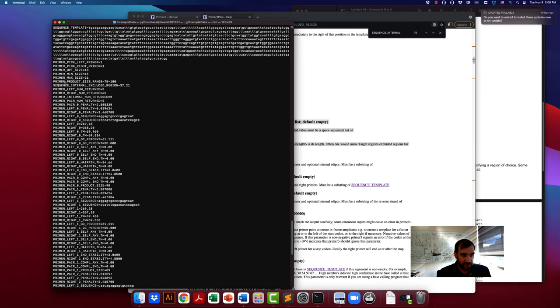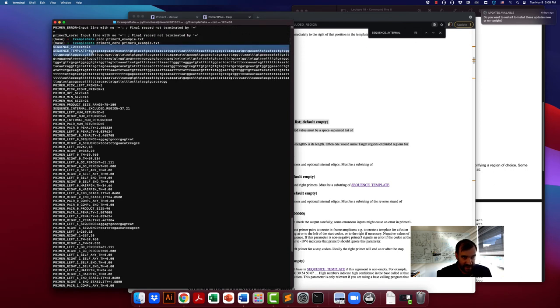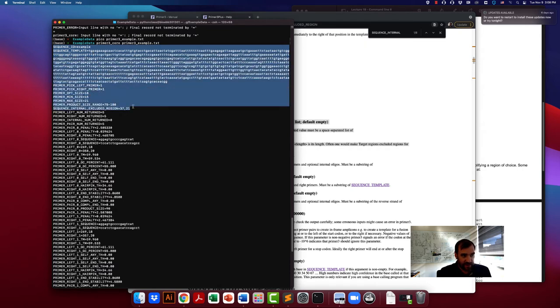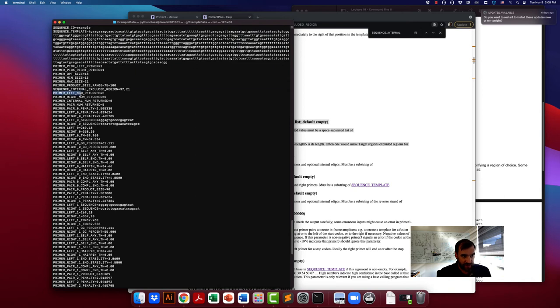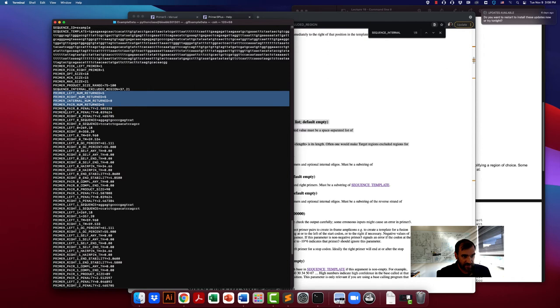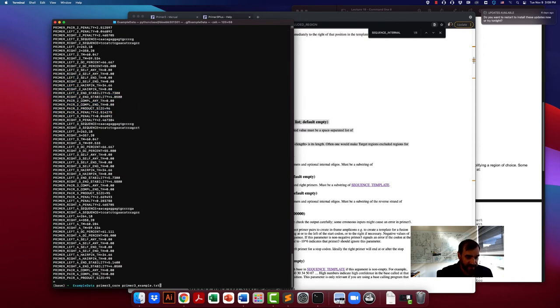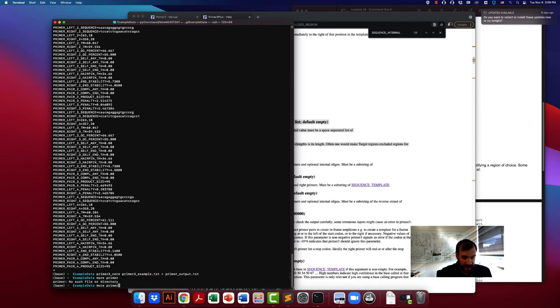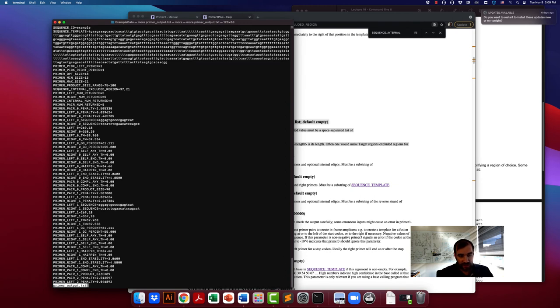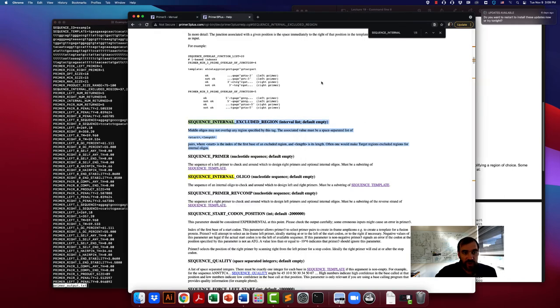We specified a very short product size range, saved the file, and now we run it and get primers returned. One thing you'll notice is that what is sent to standard output includes the arguments we specified — all of them are printed back out to standard out — and then the primers that are returned, some information about them, five primers were returned, and eventually we get to the information on that first primer. If you want to save this information, you can redirect it using the greater-than sign to a file name of your choice.